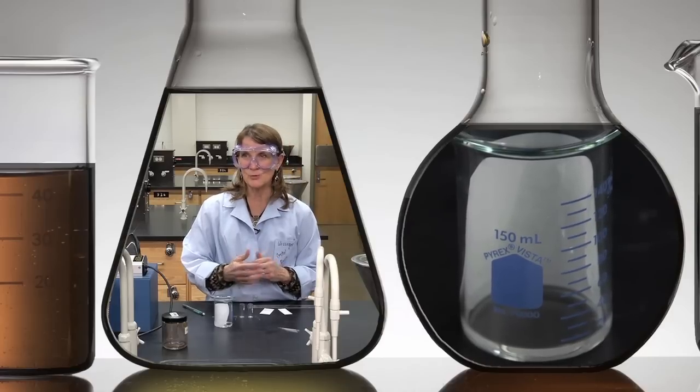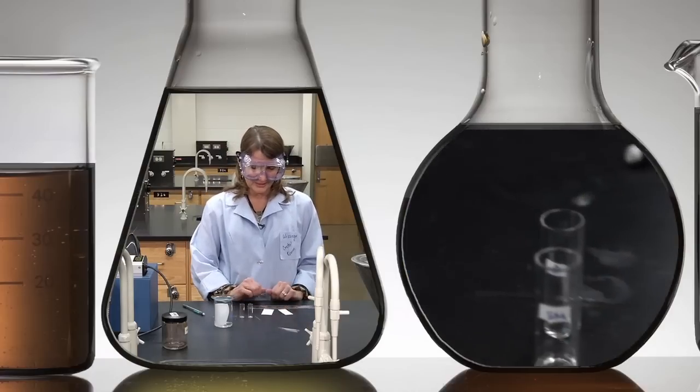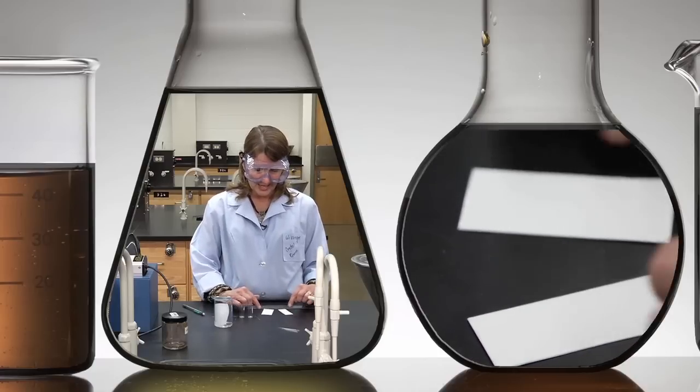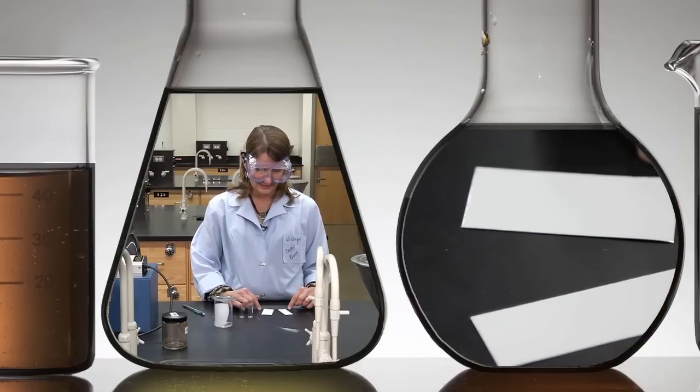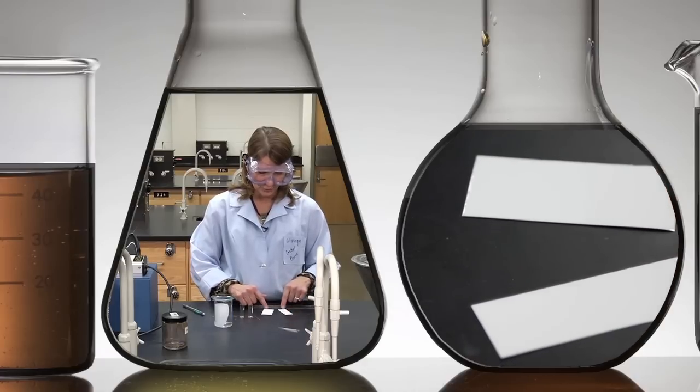The next thing we want to do is spot our TLC plates. The TLC plates will be given to you in lab and you want to choose an end, so look carefully at the TLC plates and choose an end that's not chipped, one that's most uniform.